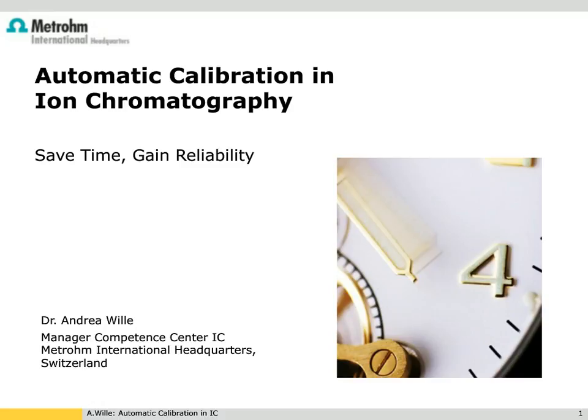This session explains the technique of ion chromatography and shows the capabilities of the new ion chromatography automatic calibration methods that are available and have been engineered to save time and improve the precision and reliability of results that in the past were done manually. Additionally, tips and tricks for ion chromatography calibrations are given to aid all ion chromatography applications.